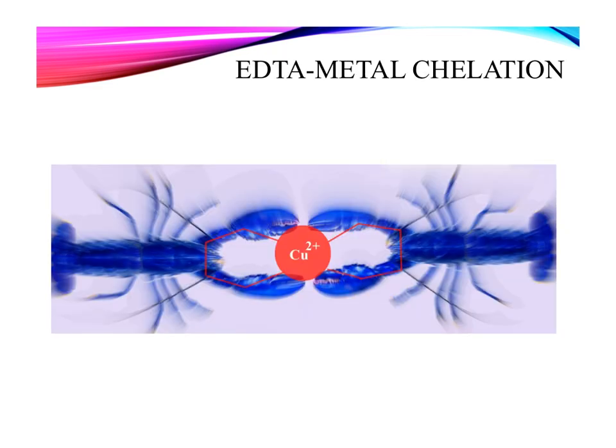When we have a ligand that can donate multiple lone pairs of electrons to a metal cation, this process is known as chelation. The word chelate originates from the Latin word chela, which means claw. Now, EDTA is a very useful chelating agent because we can adjust the number of binding sites it has available by adjusting the pH.